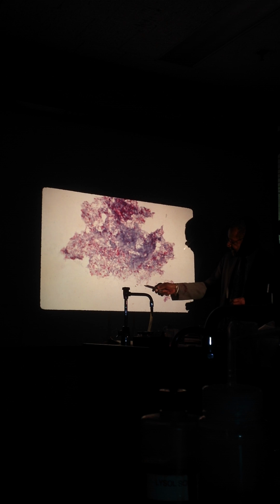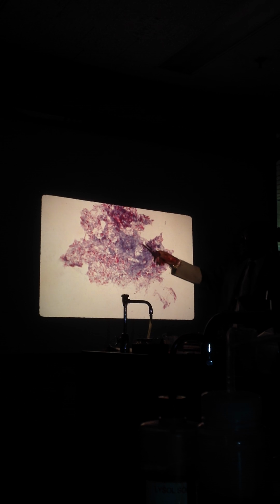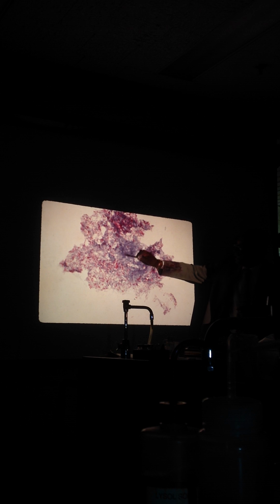If you see ones that are by themselves, if you look here, this is a bacilli, this is a bacilli, this is a bacilla, this is a bacilla. So in other words, it's red. In here you have a lot, but you can't see. You've got to look for the individual organism to tell what it is. The blue in here lets you know, you could use that as a jumping off point, that it's an acid-fast stain because the counterstain is blue.